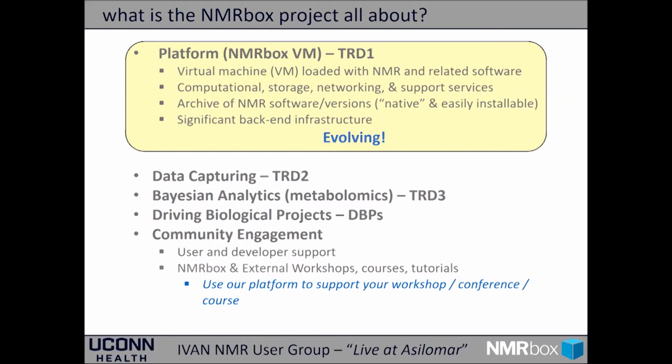So as I alluded to earlier, the NMRbox project is a larger project. It has multiple components to it. One of them is the platform, which I'm going to call NMRbox VM or just NMRbox for the rest of today's talk. What it is, is a virtual machine that's pre-configured with lots of NMR software to do your NMR data processing and analysis. It's basically zero barrier to entry. It also is computational storage, networking, and support services to run that platform for you.